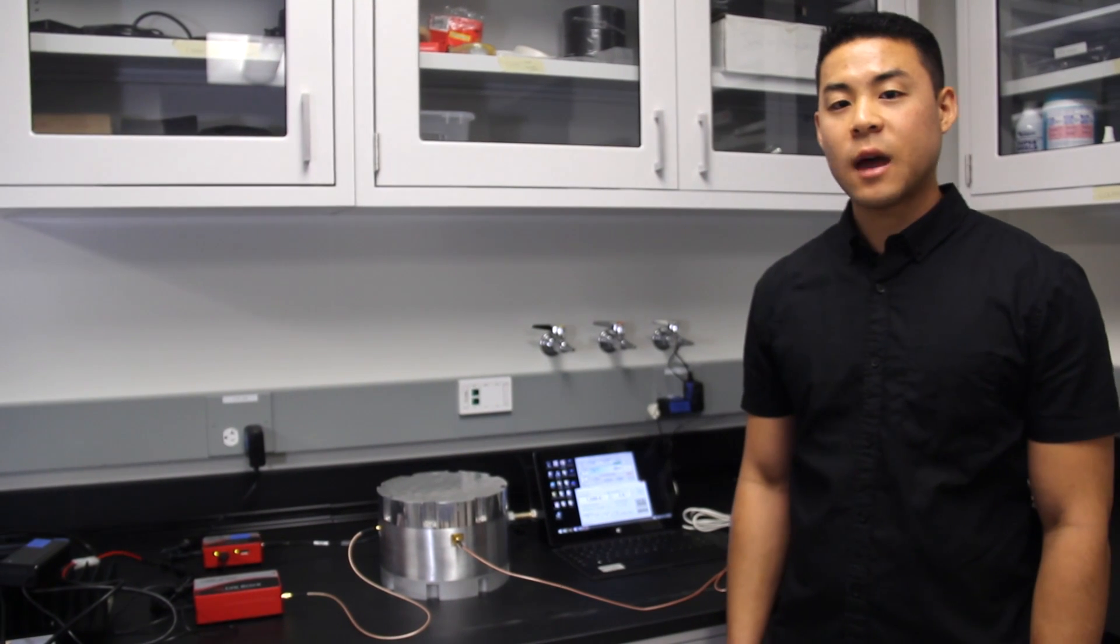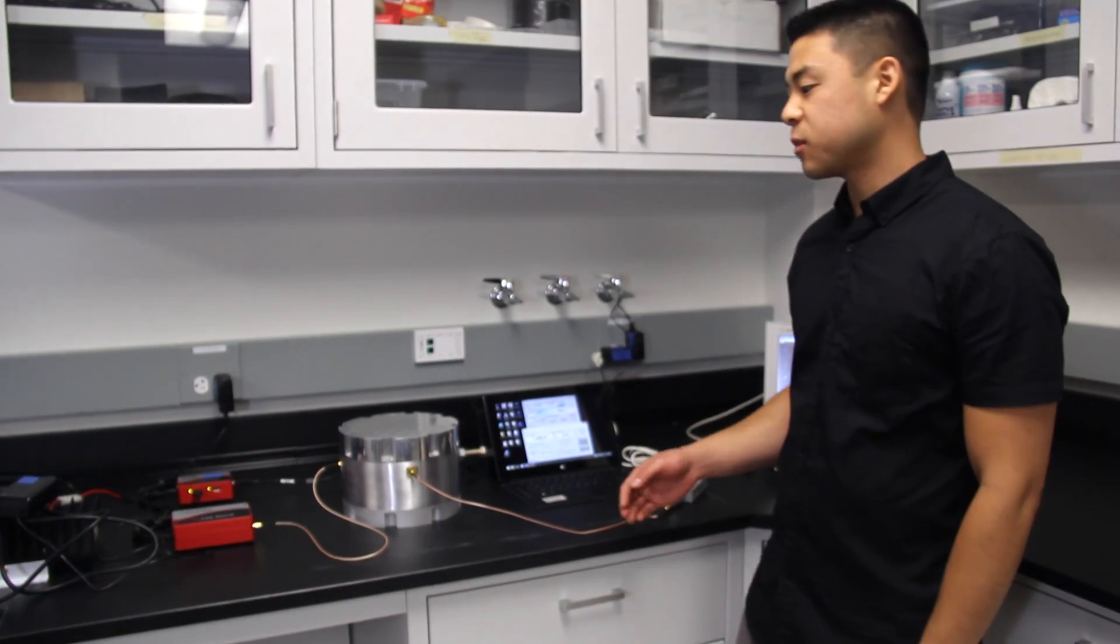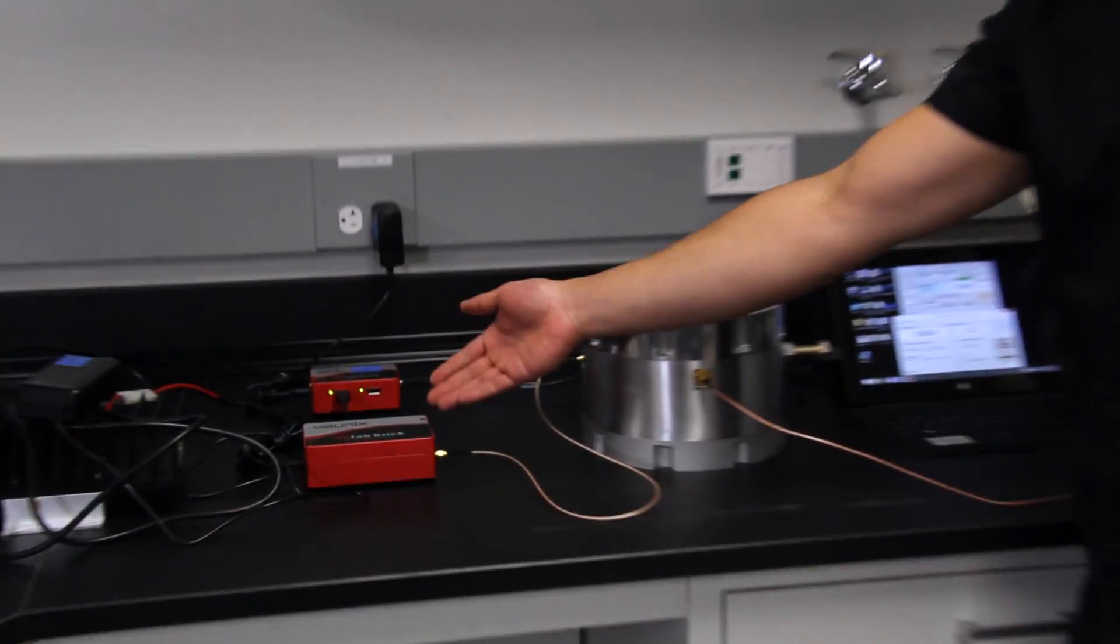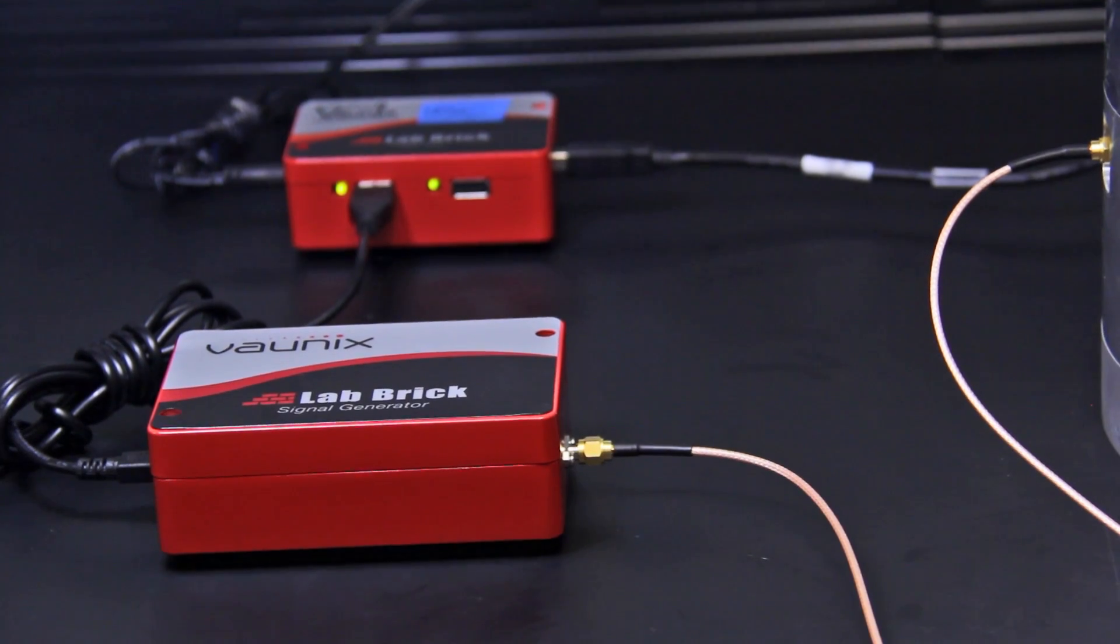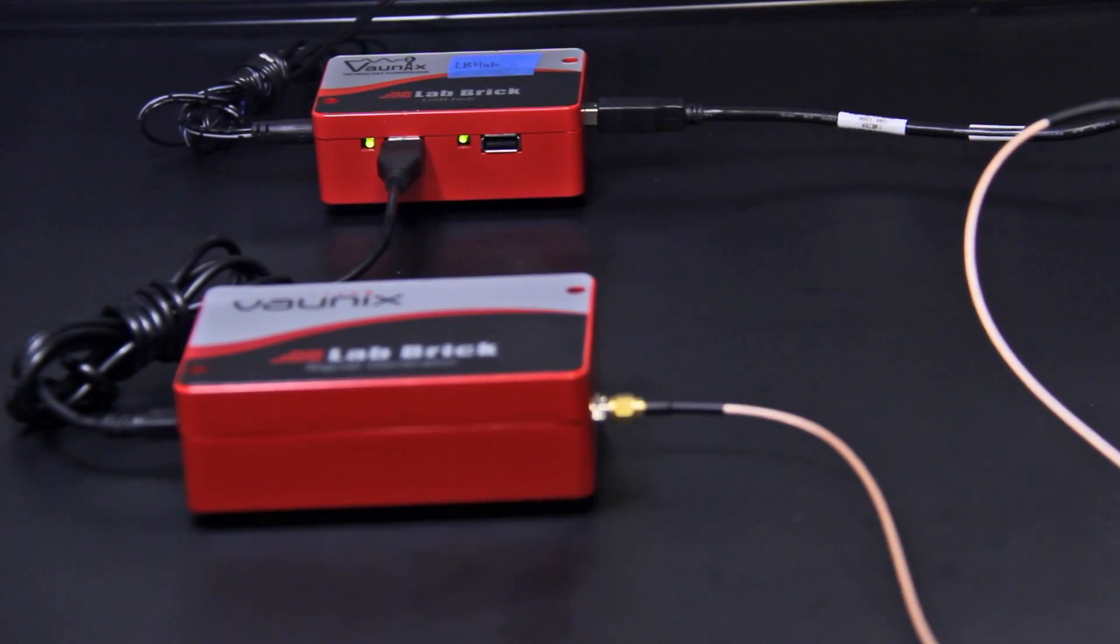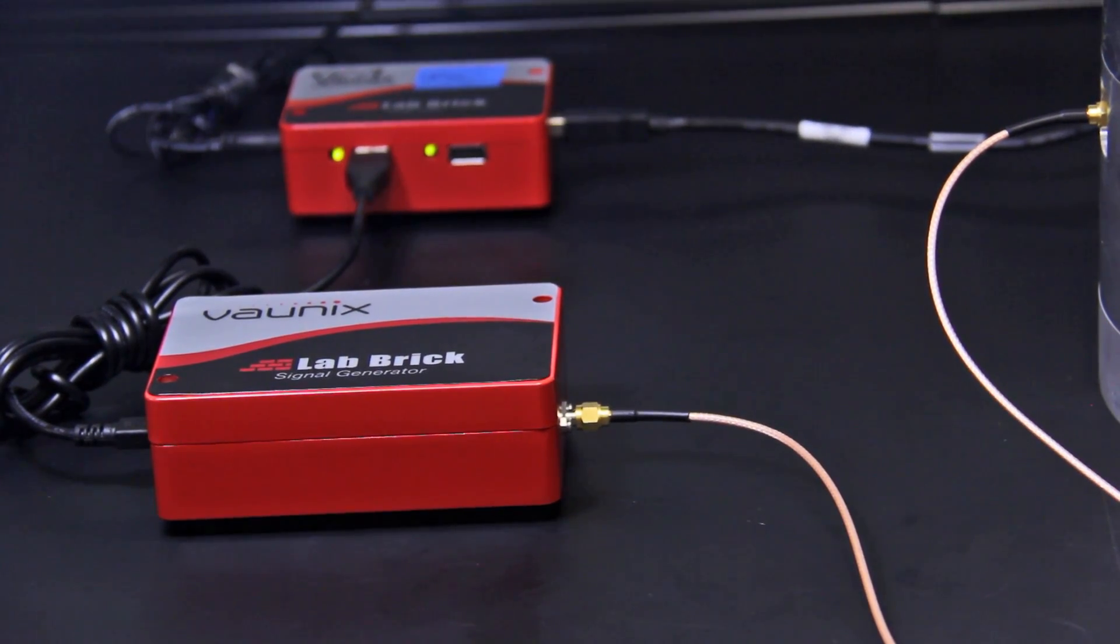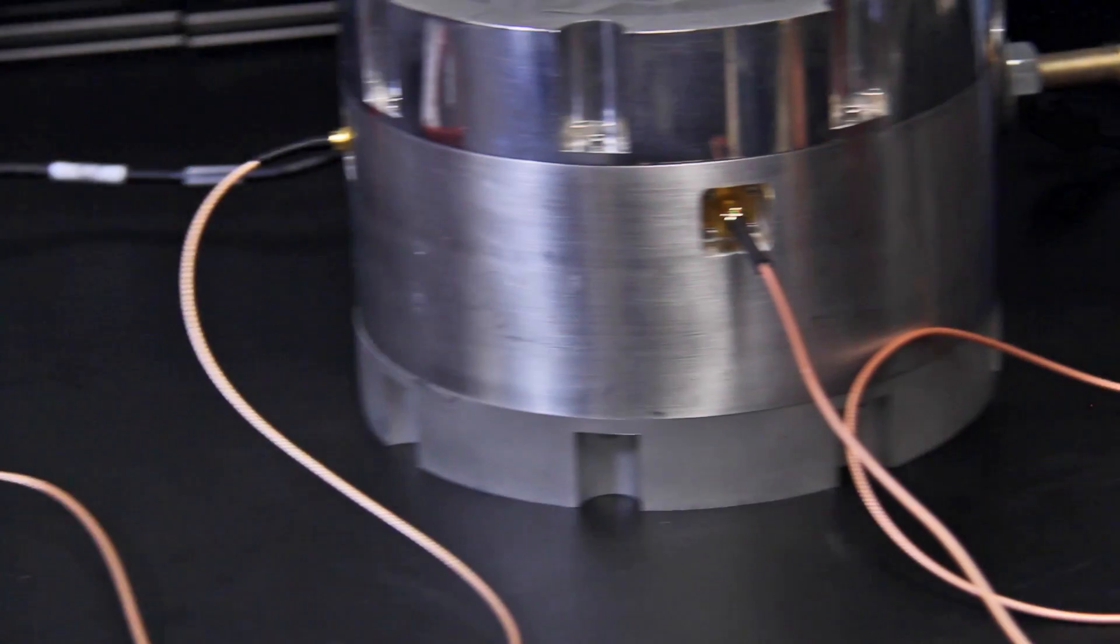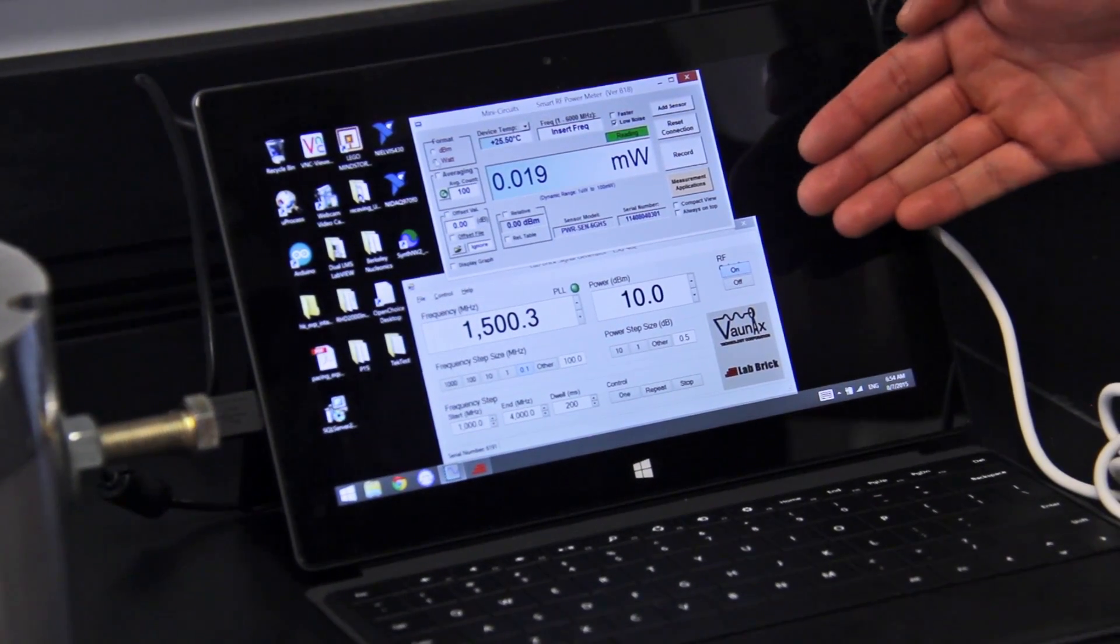Thanks. Now we'll generate the signal to send into the power amplifier. The signal generator system we have here is the Lab Brick powered by Vaunix. There's a simple to use Windows interface where you can control the frequency and power of the signal generator. There's an equally easy to use LabVIEW VI to do the same thing in MATLAB. Here, you can see I have set the frequency to 1.5 GHz and a power of 10 dBm.